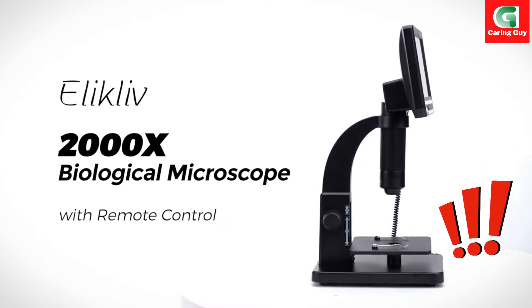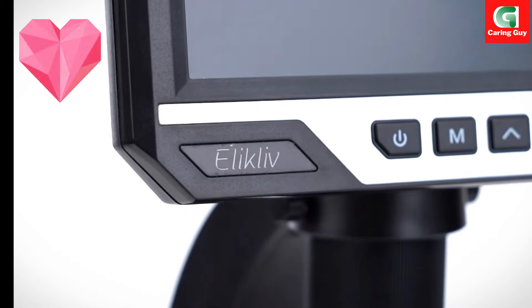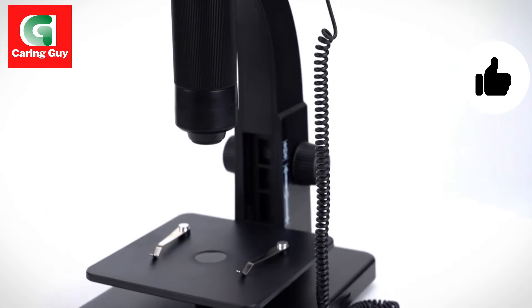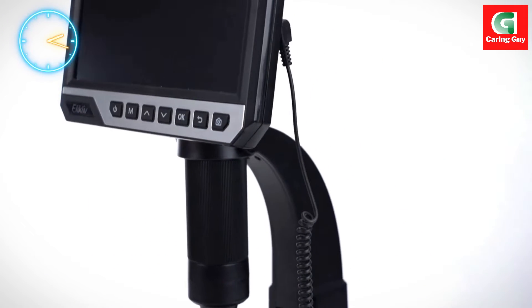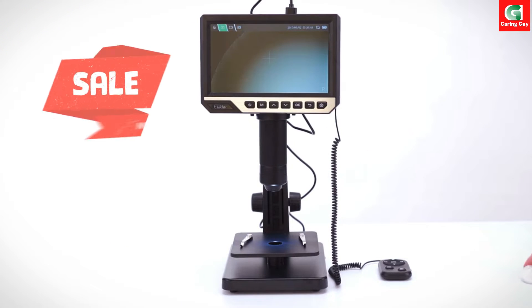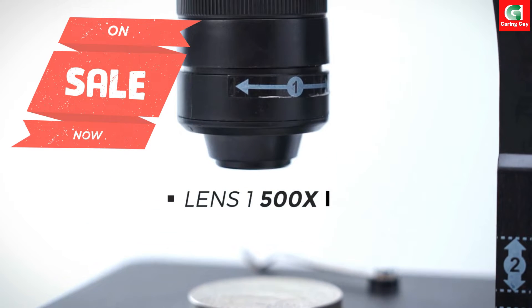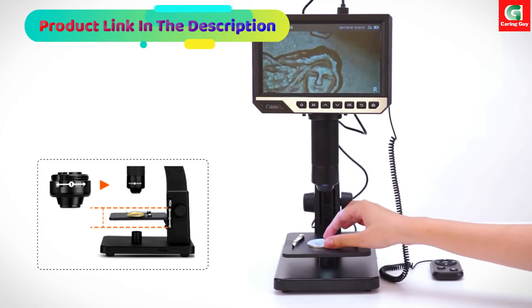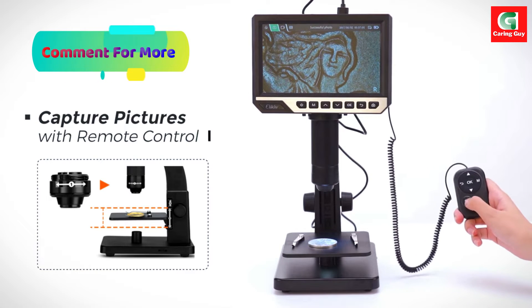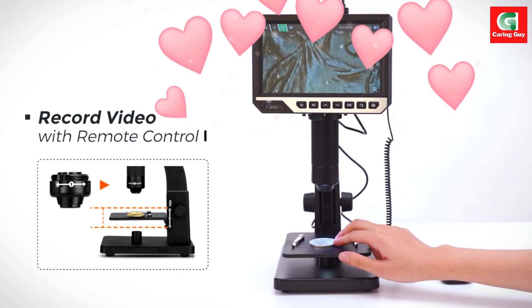The Elikliv EDM11S-2000X Biological Digital Microscope is a cutting-edge instrument that stands out for its dual lenses, remote control functionality, large IPS LCD screen, and versatile features. Designed to cater to a wide range of applications, this microscope offers advanced capabilities that make it an indispensable tool for professionals, students, and enthusiasts. Let's explore the main features that set the EDM11S apart.